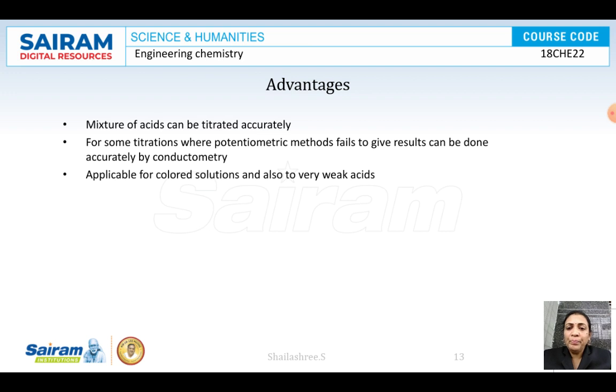These are the advantages of the conductometric estimations. We can do it for any type of solutions, turbid, colored, colorless solutions, or any normality solution. We will be getting accurate results, 100% accurate results.